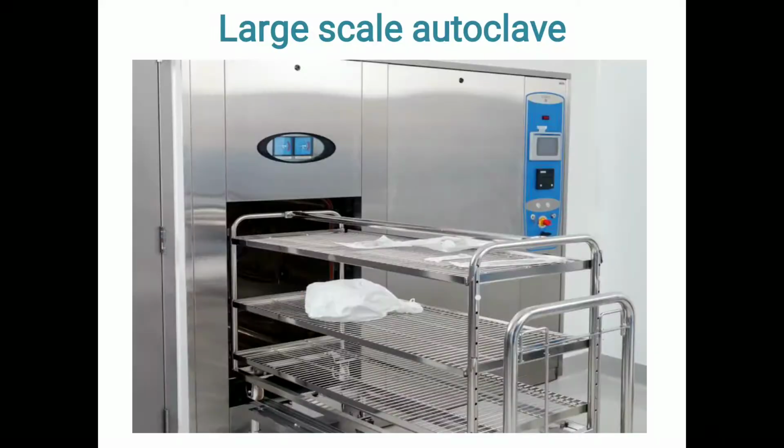But if you see the large scale autoclave, it has a different construction as compared to the laboratory autoclave. So it is the steam sterilizer.